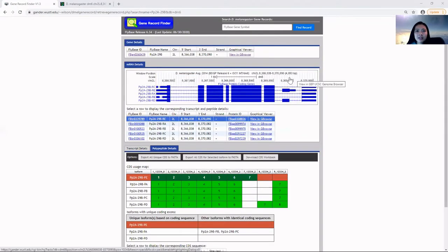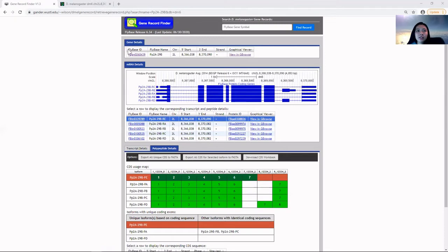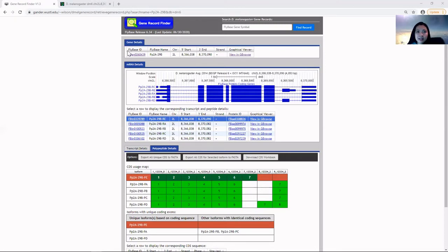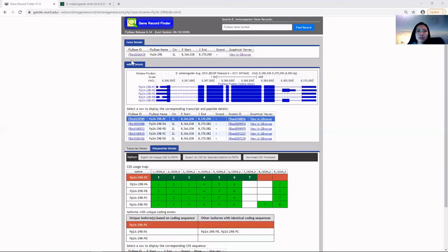Now we're seeing information for our demonstration gene. Under the gene details tab, you'll find the overall information of the gene in D. melanogaster. The FlyBase ID is the proper ID of the gene, and if you need to search for a gene, you can use this as a unique identifier.